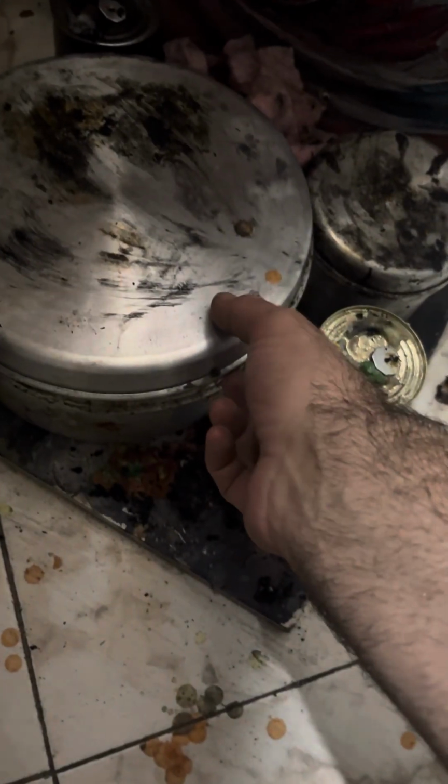Okay, so this will be all for now. Let's give it some time. Let's close it for now. It was exposed for enough time, so let's close it. Close the lid. It doesn't need to be completely hermetic. It's almost hermetic.